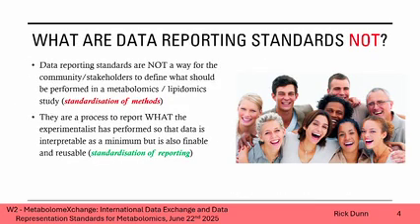So what are data reporting standards not? And a lot of people say to me, I don't want to be told how to do my experiment. Well, that's not what data reporting standards are. We're not telling you that you have to have a standardized way that you perform a study, that you collect the data, that you analyze the data, etc. This is just about reporting what you do, okay?